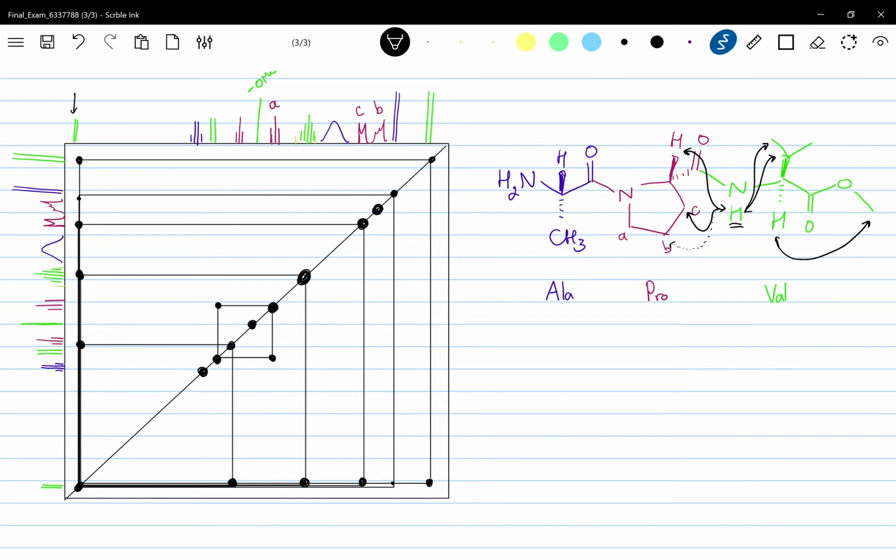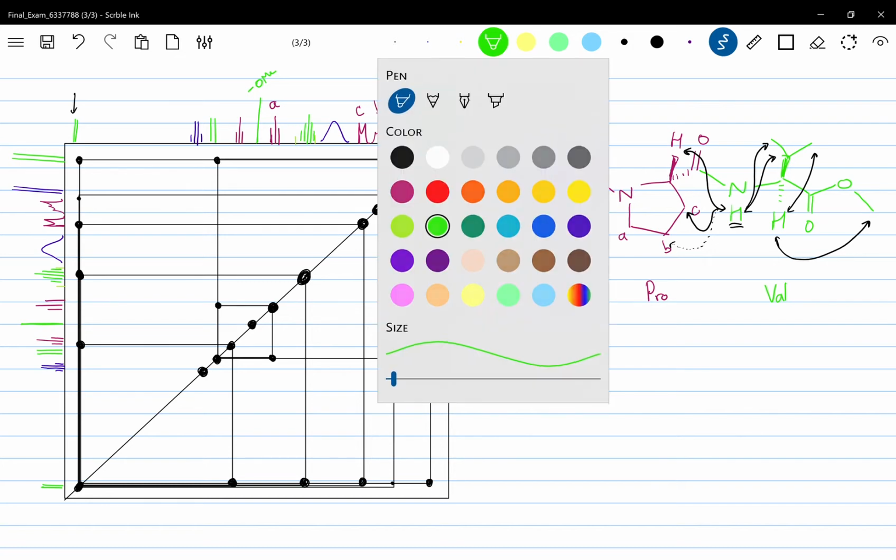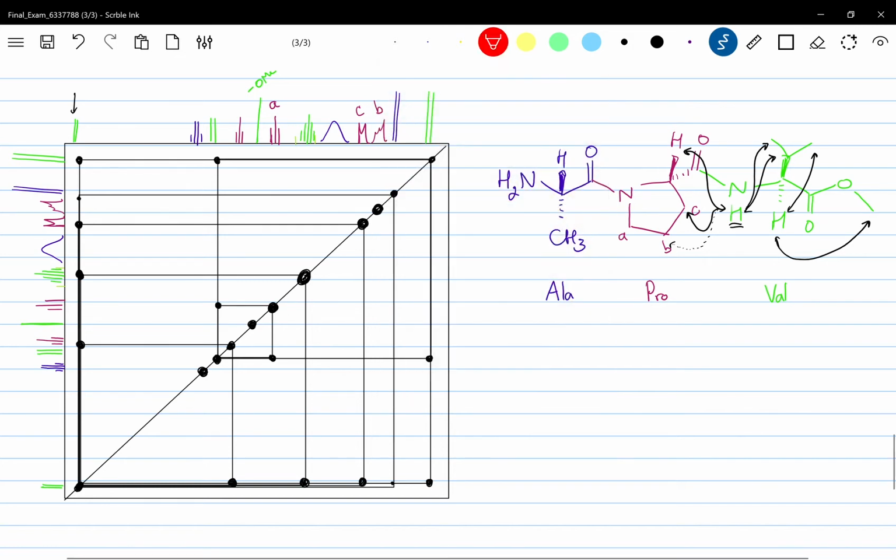Yes, it is. And it can also interact with these doublets of itself too. So the doublet of itself will be the same, this one. Yeah. And let us change some colors to, I'll say, red or orange.